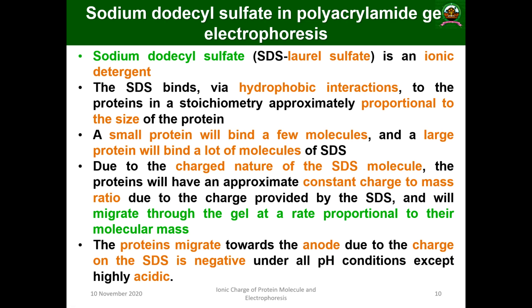Then one of the important techniques is known as sodium dodecyl sulfate polyacrylamide gel electrophoresis. One of the most important types of gel electrophoresis based on the above principle is known as sodium dodecyl sulfate polyacrylamide gel electrophoresis, or simply SDS-PAGE. So sodium dodecyl sulfate, known as SDS, or sodium lauryl sulfate, is an anionic detergent.